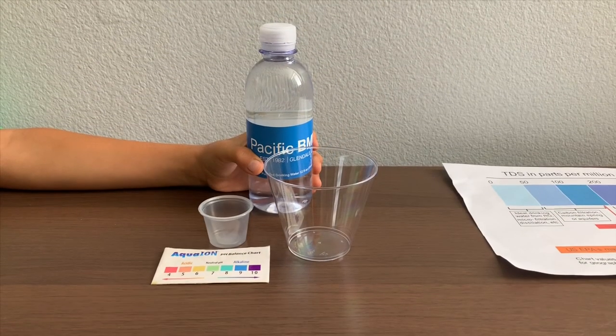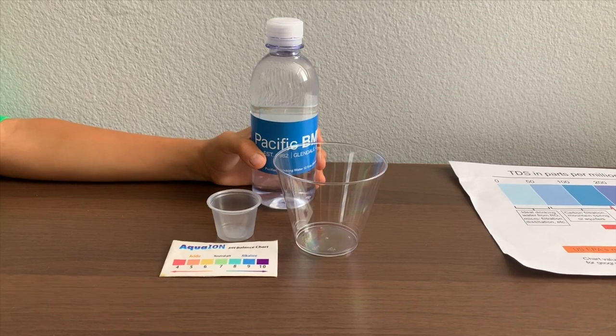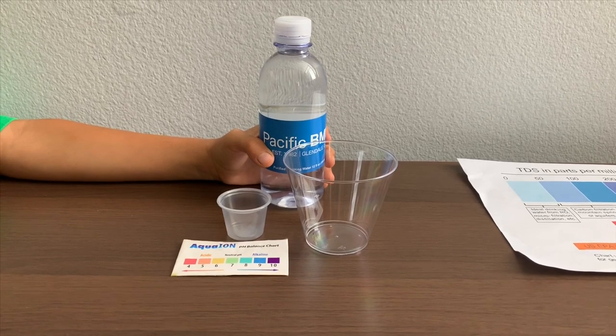This is Pacific BMW Purified Drinking Water, distributed by Custom Water. It is from local municipal sources, processed by reverse osmosis.